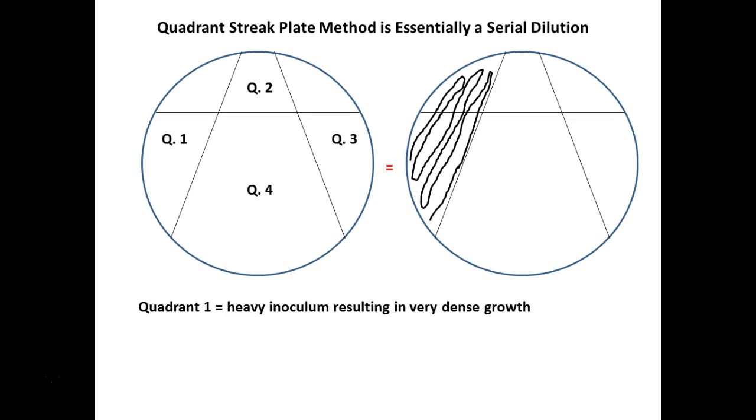Some interesting plates from yesterday. So you don't lift it up at all? You don't lift it up at all. Oh, that's what I wanted to do when I was holding the loop.